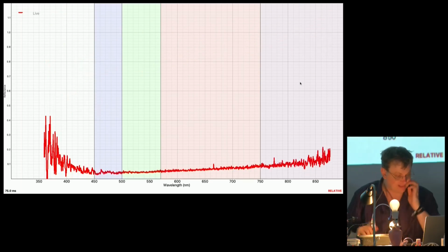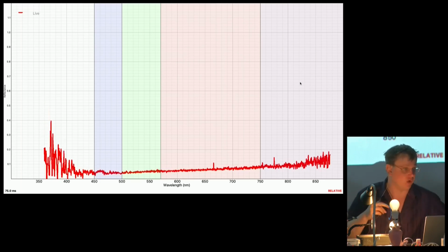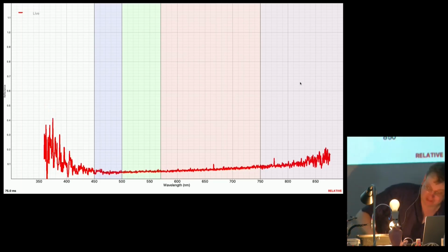So soil has a very low reflectance, it looks dark, that's why it has a low reflectance. Snow, on the other hand, has a very high reflectance. I haven't got any snow here today, can't think why. But also, you can look at how things change over time.